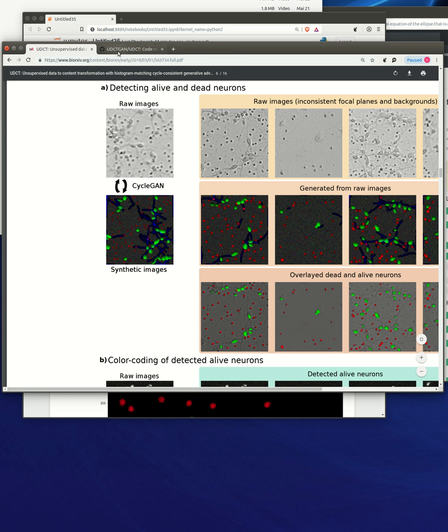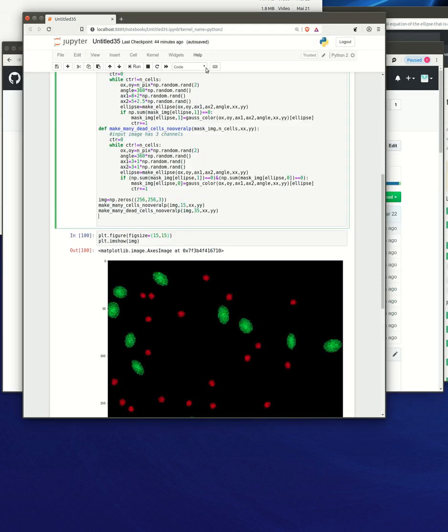So it really needs a lot of noise, or it needs noise in the background. Now the magnitude of the noise does not really matter, and again, you can check our supplementary info for these details. But the easiest way to do that is to just give it a random Gaussian noise.